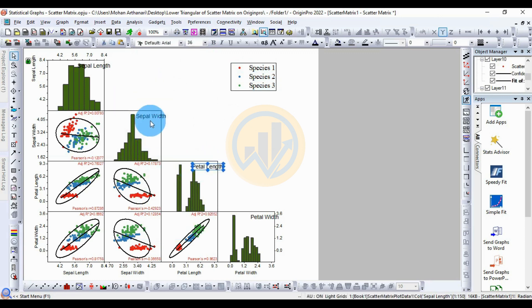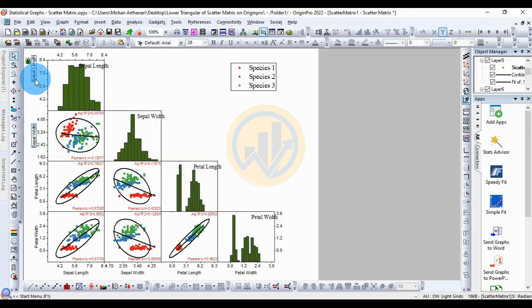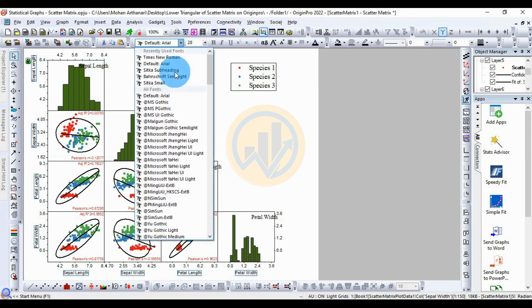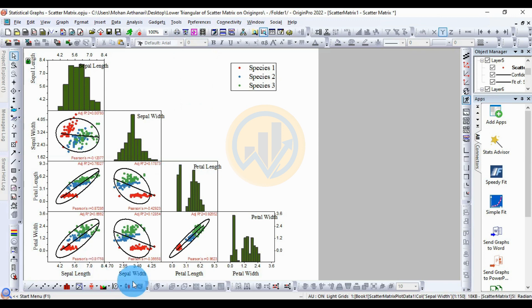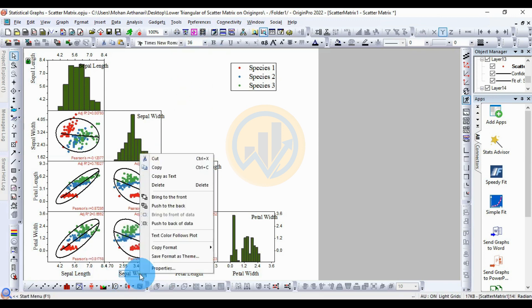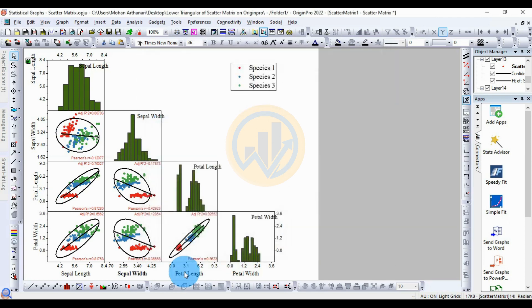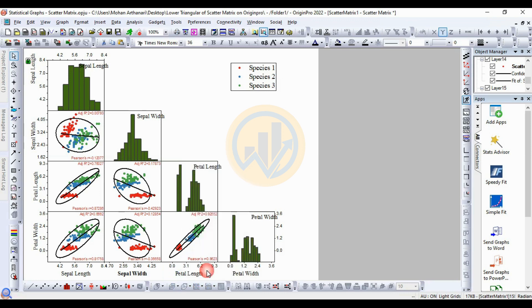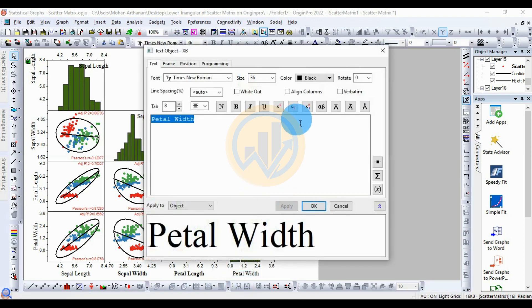Use the Control key to select all the text labels, including sepal length and sepal width. Change the font to Times New Roman and set the font size to 36. Right-click on the text and select Properties, then choose Bold. Click Apply and OK. Repeat this process for all remaining text labels — right-click Properties, select Bold, then Apply and OK.